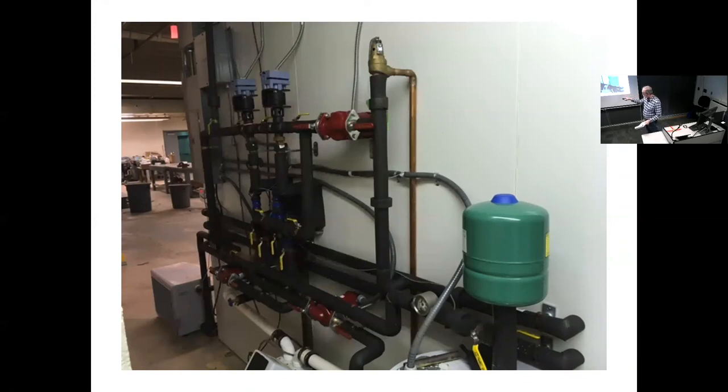That's another cool thing about these chambers. The same plumbing parts are used in every chamber, so we would only have to stock a few parts to be able to be used anytime on any chamber. It's a lot different than the way it is now. We have a large part inventory. The chamber is currently working at Guterman in room 139, and you are welcome to check it out anytime you're up there. Just feel free to walk in. There are plants in there, but it's not an experiment. We just wanted to see how different species would grow in that chamber. I should mention that since Guterman does not have the infrastructure like Weill Hall to support this kind of chamber, we had to design it with its own chiller. There's the chiller and its own hot water heater. So the chamber kind of uses that equipment until such time as we can get a new infrastructure at Guterman to support this kind of system.